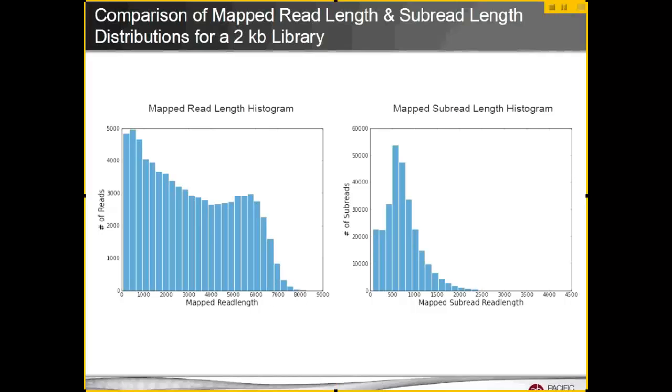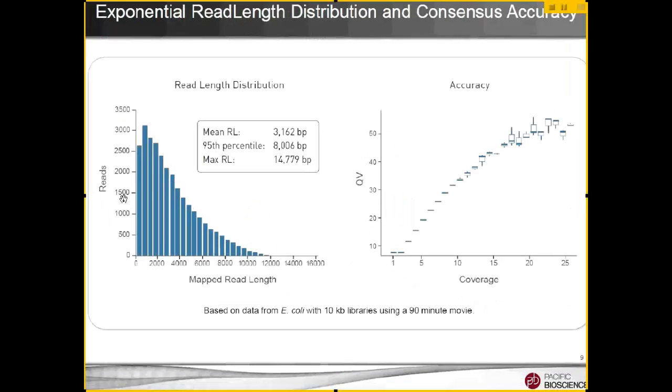And why this curve is important, this is actually a better curve to be looking at. So you can see here, this is basically your read length. Like I said, you can get really long reads. This is a little bit older data. You can imagine this actually goes out to about 20K, and this curve starts bottoming out near 20K. Sometimes we've gotten a few up to like 25K. The distribution still extends, but the majority of the reads still tend to be down here in the lower region.